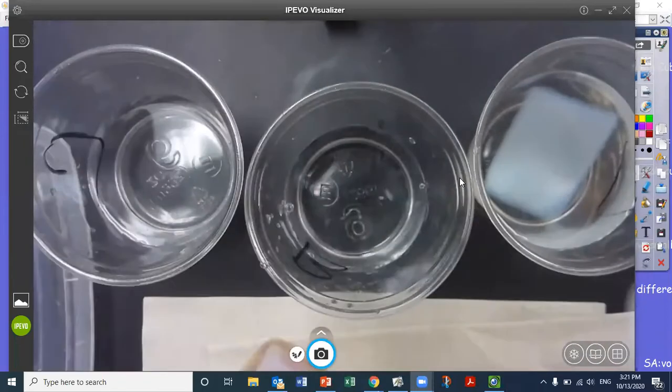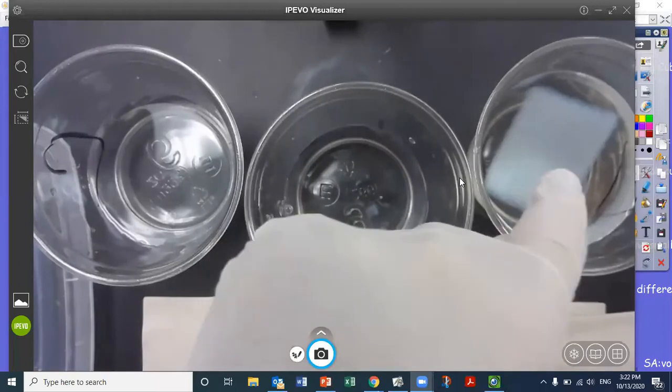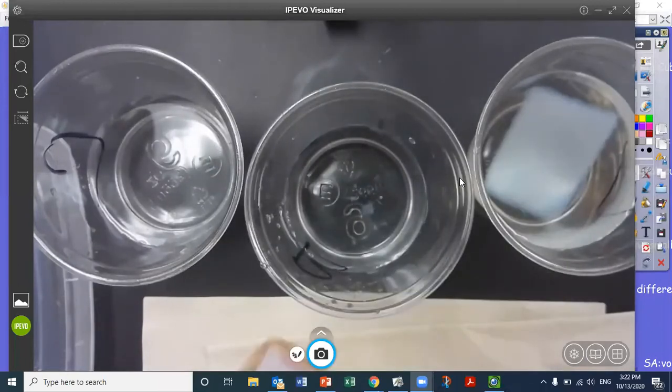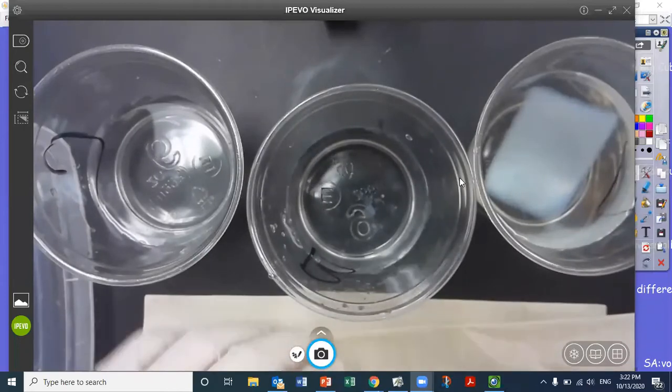And as you can see, we're not even going to bother with this one anymore just because we know it's done, it's been done, and it's never going to turn pink back, you know? So we're just going to work with the small cubes and the big cubes right now because we still have to do calculations on those.